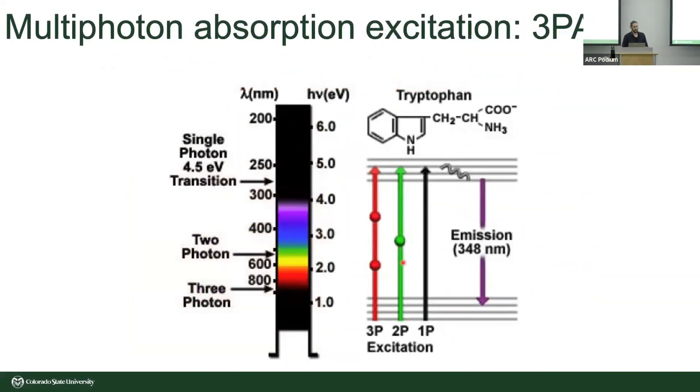Okay. So last thing I want to talk about is some of the examples of using multiphoton might not be obvious. So I already kind of gave you an example of confocal resolution is slightly better. So if I had just single cells that were mostly transparent in a petri dish, I would often opt for confocal. However, there are some multiphoton excitation strategies that are beneficial for seeing things you wouldn't be able to see with confocal microscopy. So one example that we worked with in the lab years ago was tryptophan fluorescence. So it turns out that exciting tryptophan fluorescence, the 1-photon absorption is around 270, 280 nanometers, somewhere in that range. Getting optics designed at that wavelength is very challenging. It's very difficult to use because glass starts to absorb at those wavelengths.